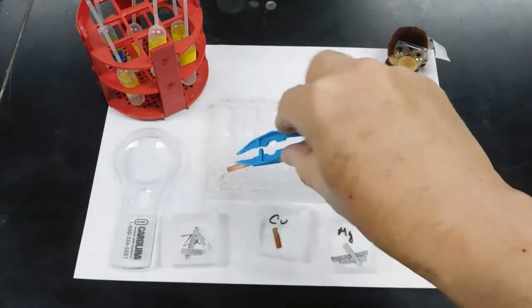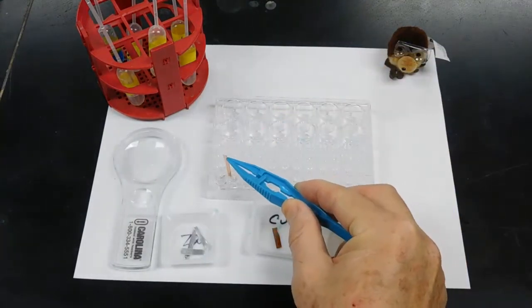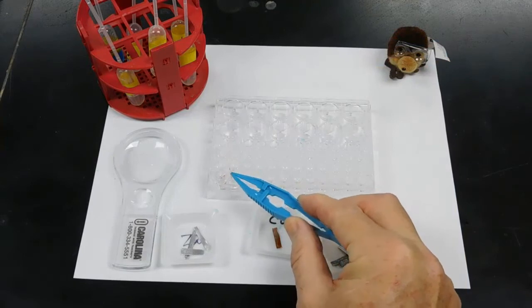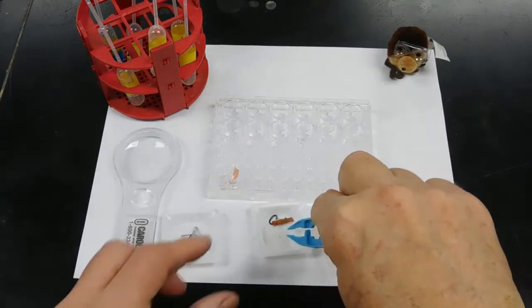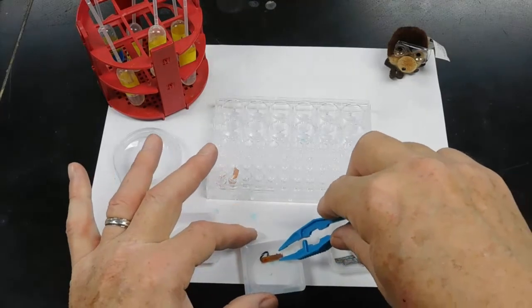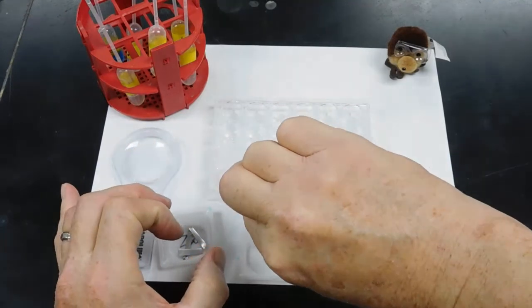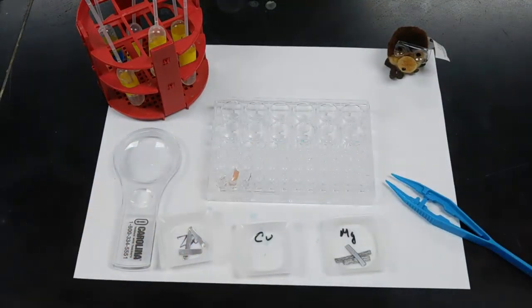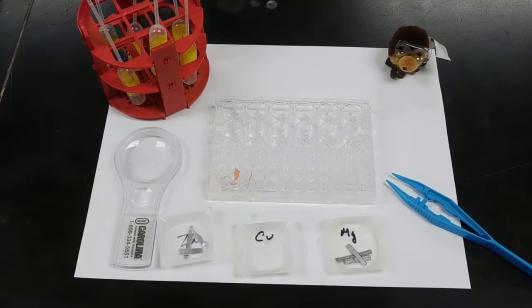Having noted the appearance of the copper before putting them into the solution, I can then compare the properties of the copper metal both before and after. So now they're sitting in the solution. I'm going to wait for 5 minutes approximately, and then take a look at the appearance of the surface of the copper metal.